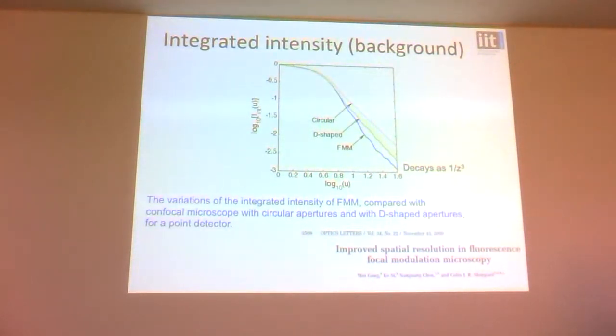When you say you use 2 half lenses, is that physically 2 different lenses? No, it's one lens. You just shoot off-axis on both sides, right? Yeah, we use one lens and we feed the light into the 2 halves.